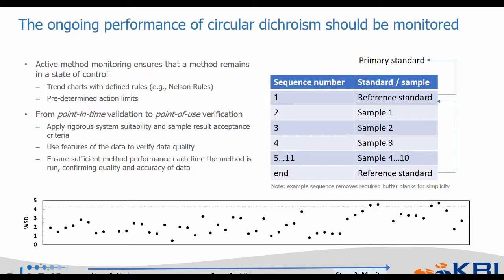All right, one quick slide on monitoring, and then I'll summarize at the end. So the final stage of lifecycle management is ongoing monitoring of the method. And this is a step that is often not performed for characterization. One, I believe, that should be. We need to demonstrate on an ongoing basis that the procedure remains in a state of control.